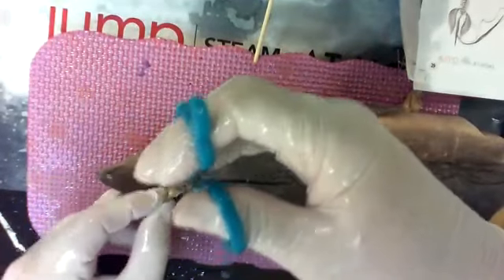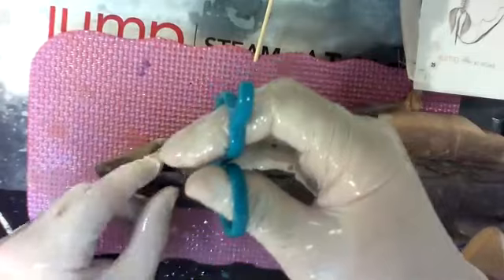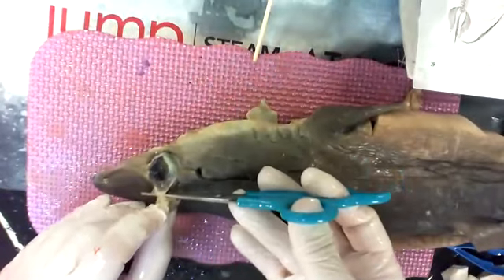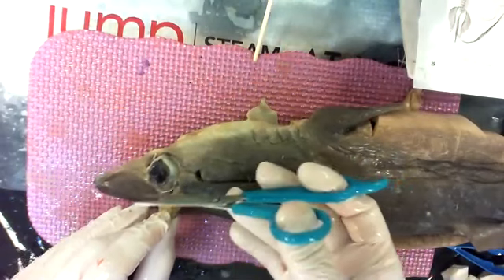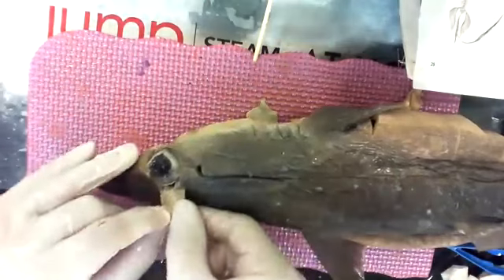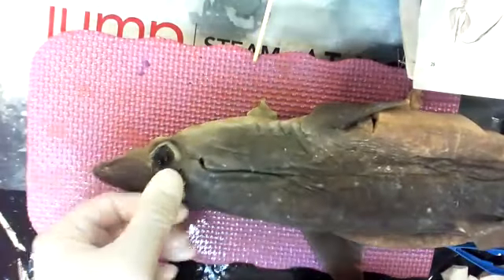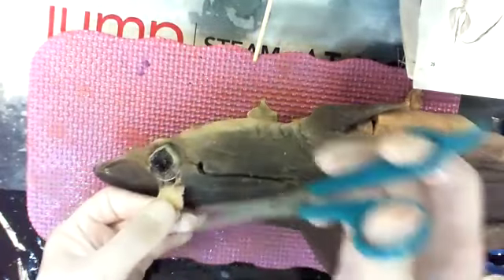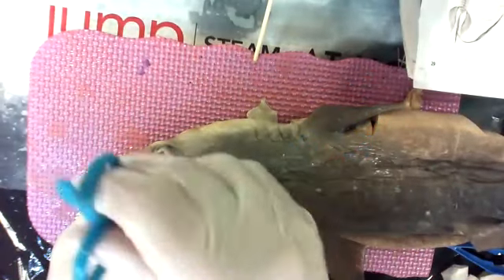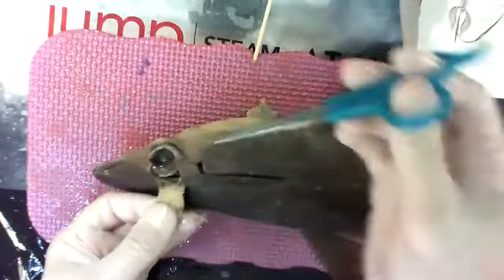If you don't want to pull back on it, you can just cut. I'm cutting now. There's a membrane around the eye. This membrane is called the conjunctiva. That conjunctiva, if it gets inflamed, you throw the word itis at the end of it, and they call it conjunctivitis. Most people call it pink eye. So there's the membrane.